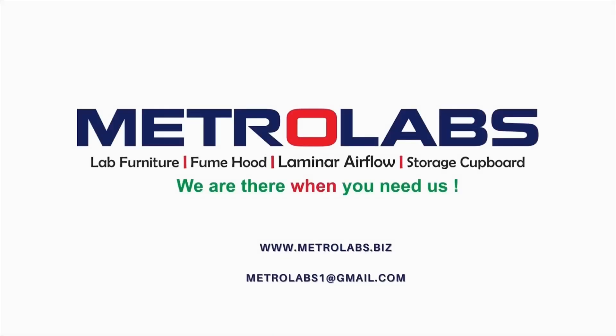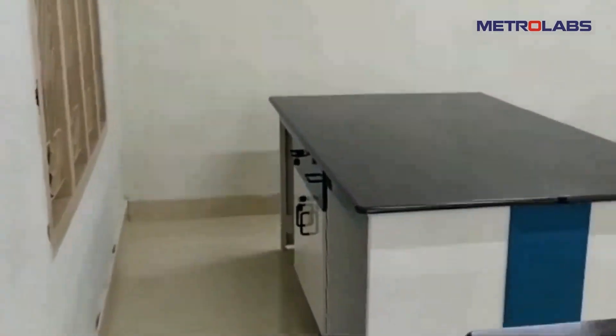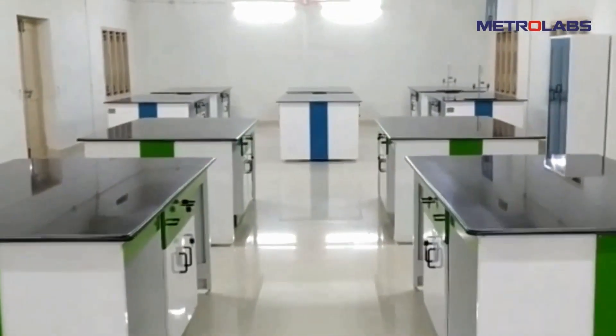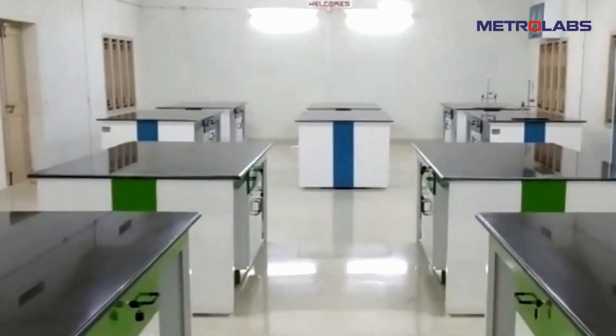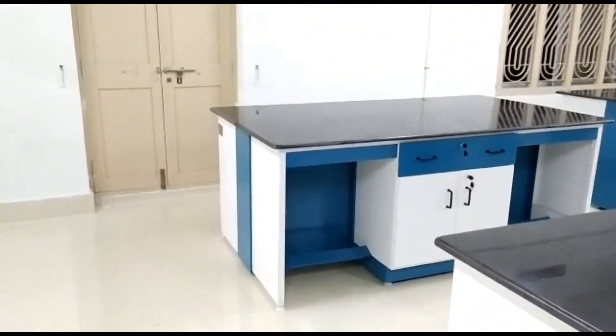Welcome to Metro Labs School Biology Lab. While designing the school biology lab furniture, the first thing to consider would be the dimensions of the lab and plumbing line. The second factor to be ascertained is the student batch strength.